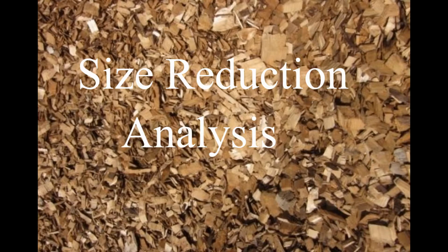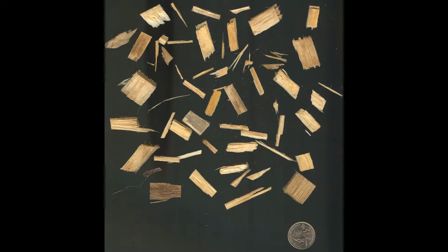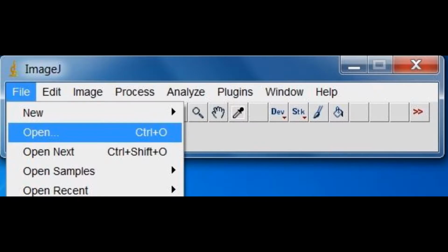First, make sure ImageJ software is installed on the computer you wish to use. After that, either obtain image files of scanned biomass particles or gather your biomass you wish to use for the particle analysis. Disperse the particles onto the scanner, making sure they are separated and easy to distinguish between the different particles. Include an object with an already determined diameter, like a quarter. Scan the necessary images into the computer to be used with the ImageJ software. With the proper image files and software on the computer, you should be ready to start your particle analysis.